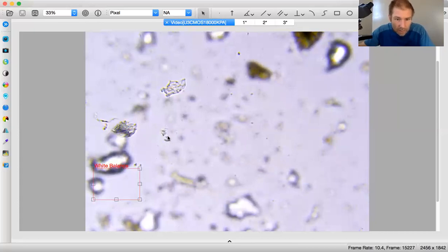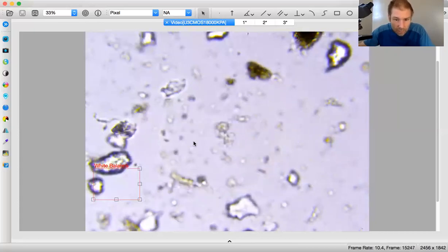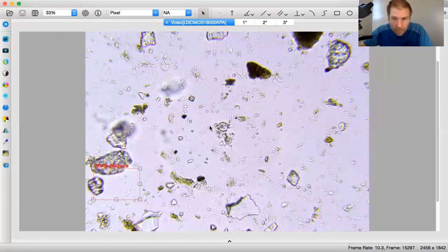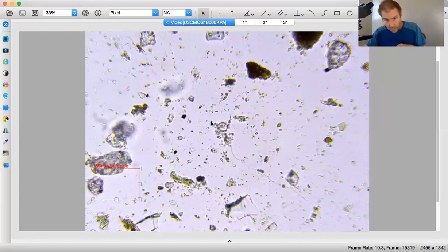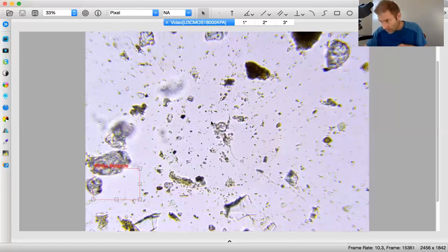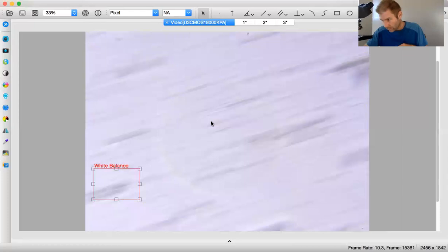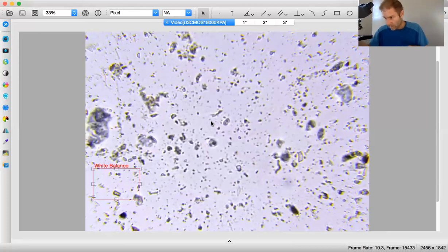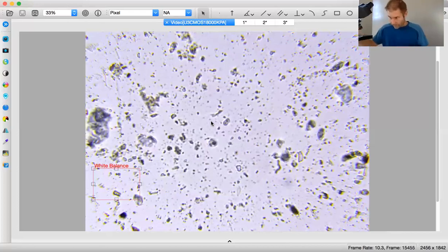So I'm going to call that organic matter. I'm not comfortable calling that filament. Okay, moving forward. No protozoa. That was reading area 2, field of view 2. So moving on here. This is 3.